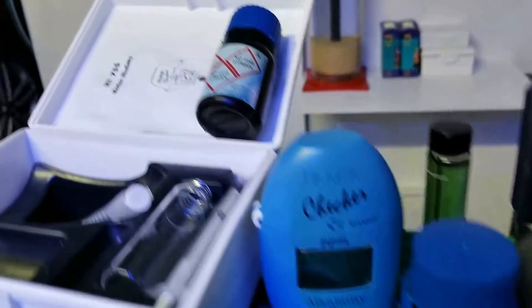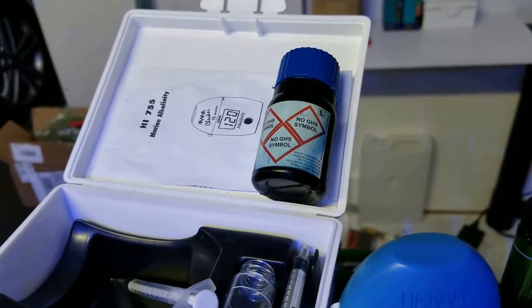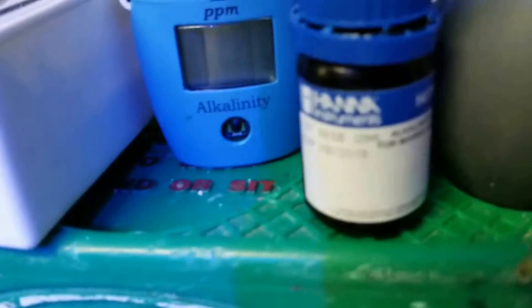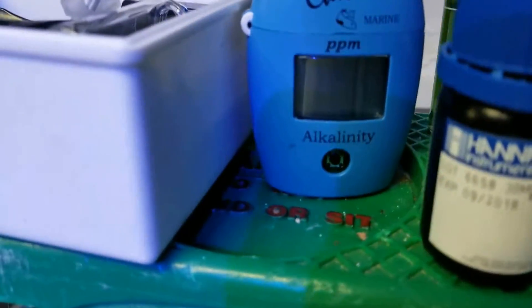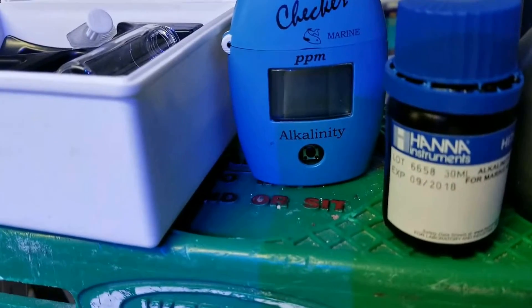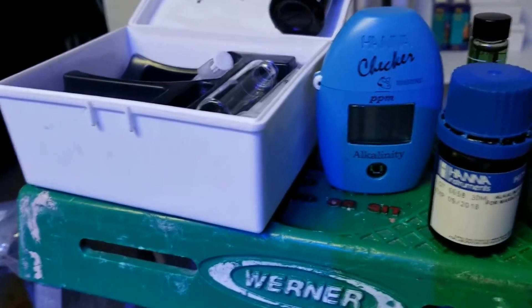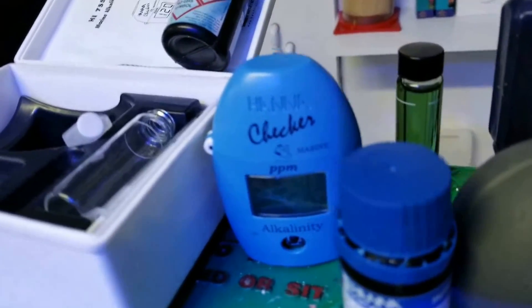The difference is this one's reading 202 parts per million, and the real reading with the brand new reagent — that hasn't leaked out the sides and has nothing floating in it — was 155 parts per million. So I'm thinking my alkalinity is 11 or 12 when it's not really.